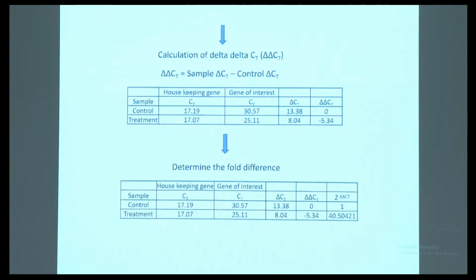So these housekeeping genes, we will be standardizing them based on multiple experiments. But if you are checking gene expression under some different type of treatment other than this, where the housekeeping gene is already checked, can I use the reference gene from here or do I have to check the housekeeping genes again for my experiment? It is a good idea to check it again, but still if you are lacking consumables at another time, then you can use it, no problem.